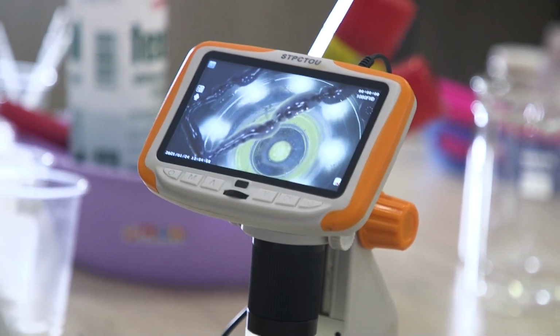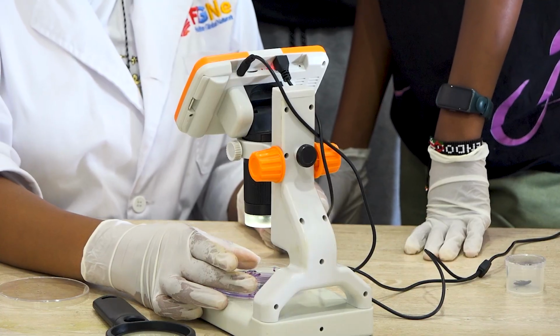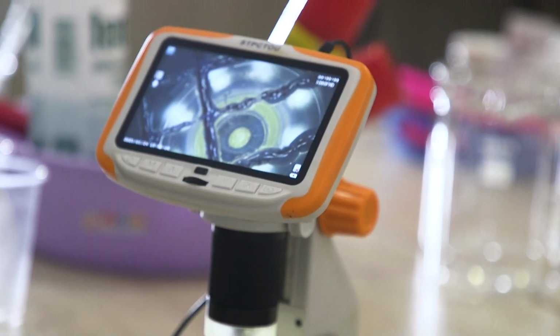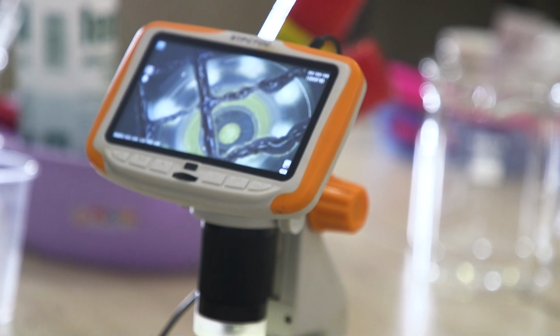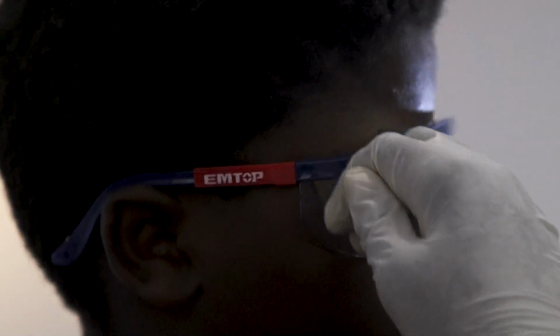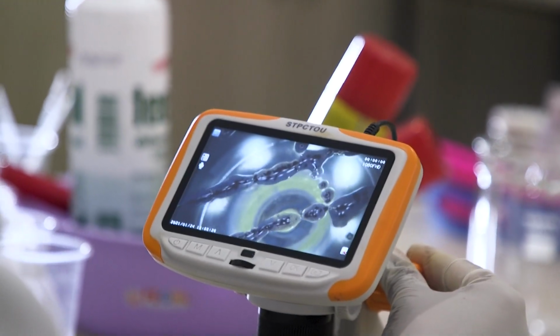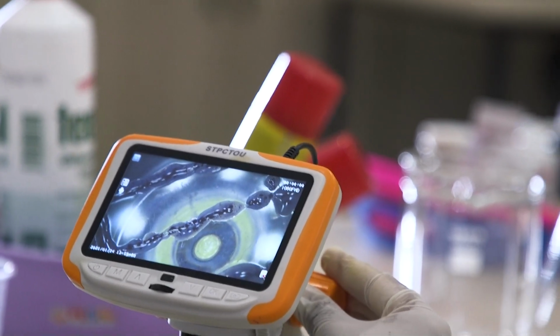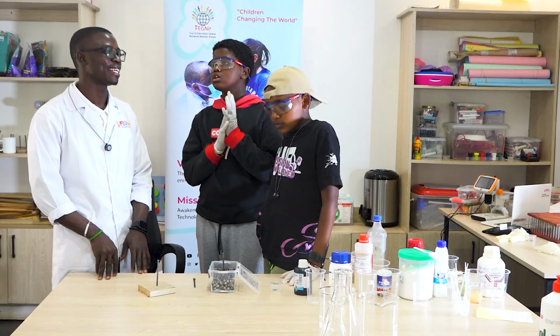You're always told to take probiotic yogurt. So which kind of bacteria is it? I mean the beneficial bacteria that is present in the probiotic yogurt. I don't know which one is present. You can see the colonies, they appear in streaks. And that is it.